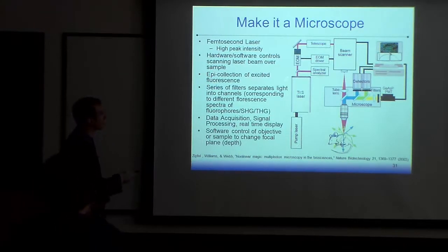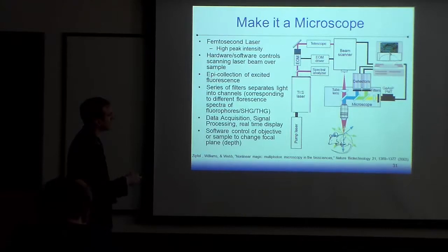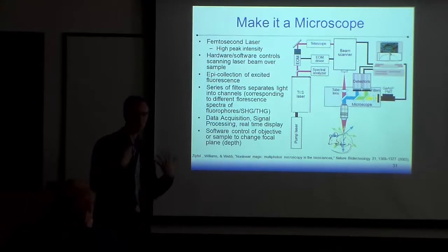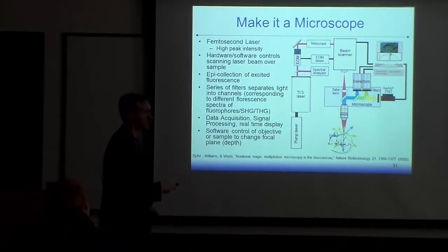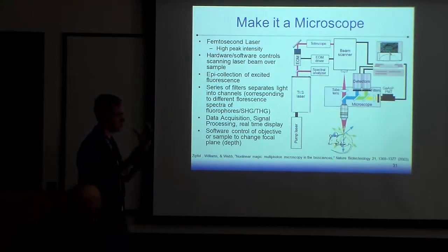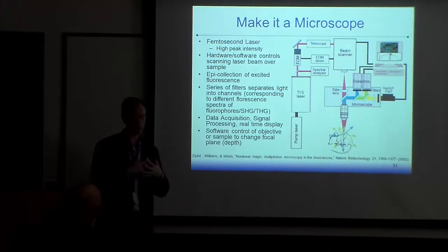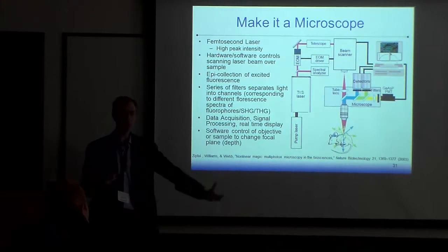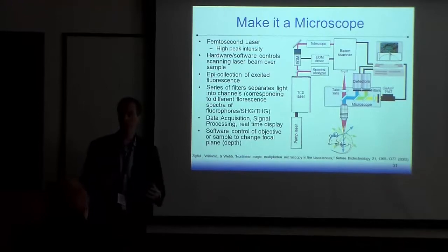So we have this pulse laser here, and we send it through some type of scanning system. So light will go through, and then we can raster scan our laser over our tissue. And it goes through our objective into whatever we're looking at. Then the light is going to be emitted back. This nonlinear signal comes back. We're going to have a series of filters so we can detect each of the different wavelengths of this nonlinear light coming back. And then from this, we can use a computer and bring it all together and get this somewhat hyperspectral mapping of nonlinear emission as a function of position on the order of submicron resolution inside of tissue.